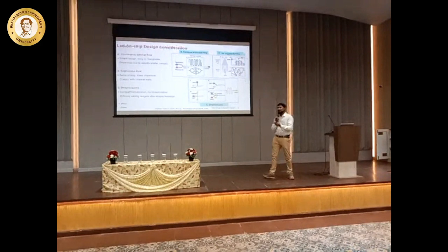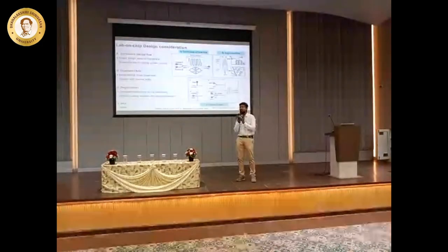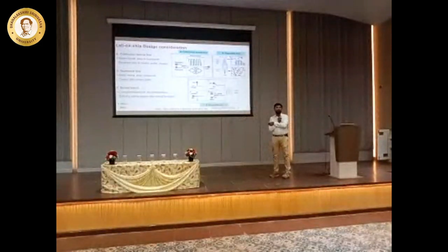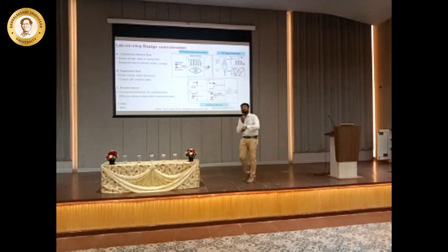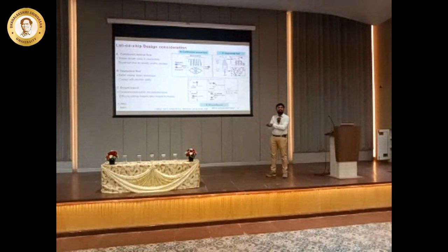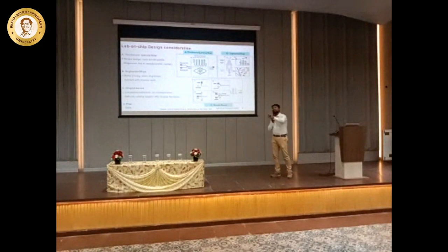The droplets really make the specific concentrations that can be added within the droplet the same across all the droplets. Now you can ask me, sir, you're going to have gold chloride, and now I am adding a precursor material, a reducing agent. So now I want to add another material into the droplet. Is it possible? Yes, that is also possible if I have another inlet that can fuse exactly onto these droplets. So fusion of droplets can also happen within the channel. Then I can control how much concentration I need to add to this droplet.